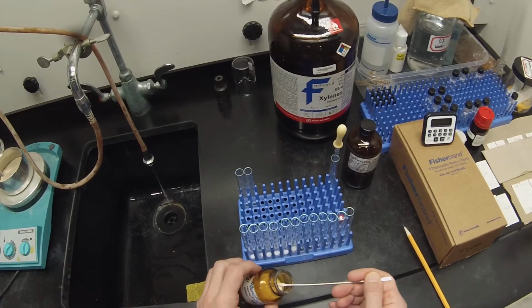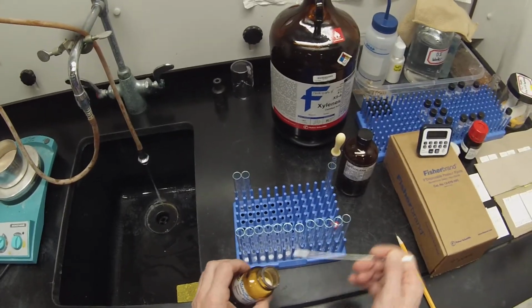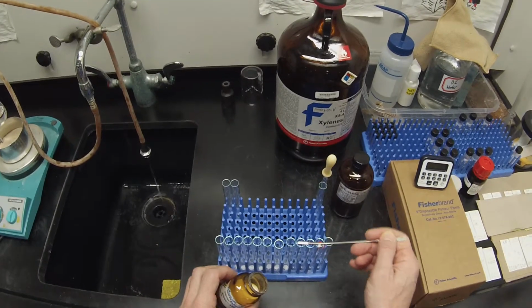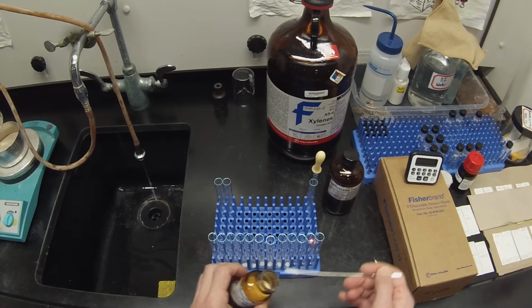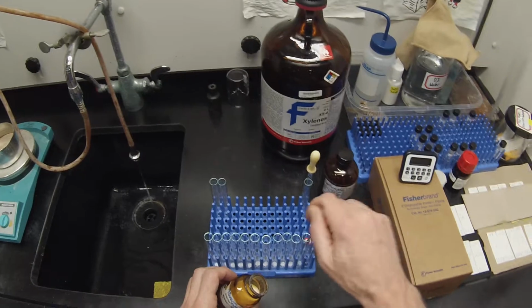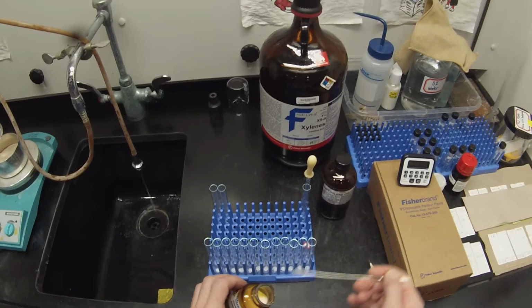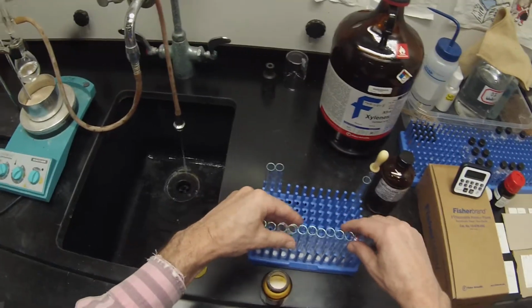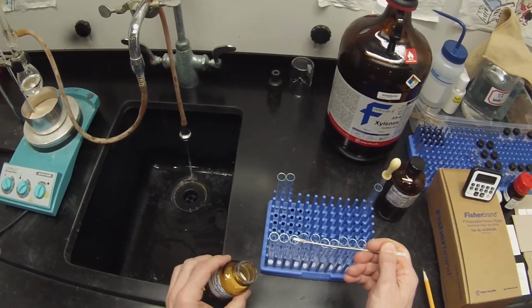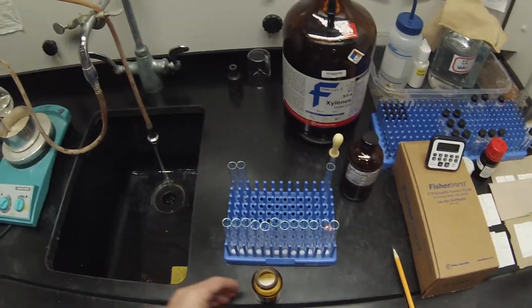At each time point, we're going to take out a half milliliter aliquot of the reaction mixture and add it to this potassium carbonate to immediately stop the reaction by quenching the para-toluenesulfonic acid. Vortex to mix, and then we will centrifuge it, take the supernatant and put it in a mass spec vial. A little skimpy on that second one. And dilute it up with dichloromethane so we can set up a batch file to run overnight with all our samples.